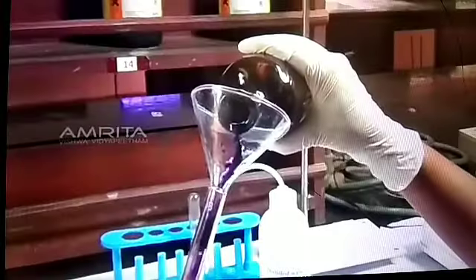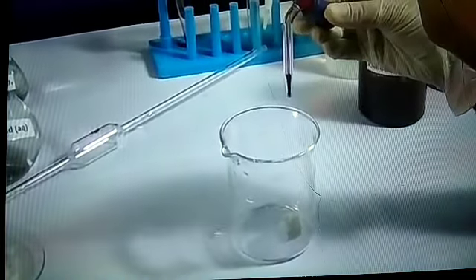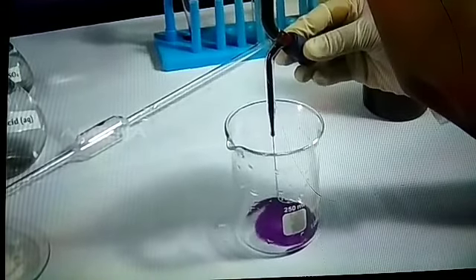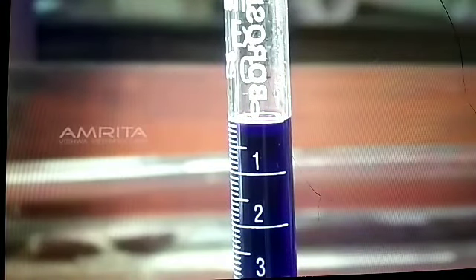Repeat this process 2 or 3 times to remove any moisture inside the burette. Use the funnel to fill the burette with potassium permanganate solution to just above the 0 mark. Take the beaker and place it below the burette and slowly open the stopcock so that potassium permanganate is allowed to run out into the beaker and set the initial burette reading as 0.